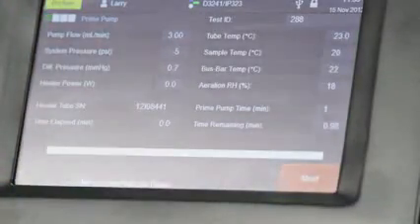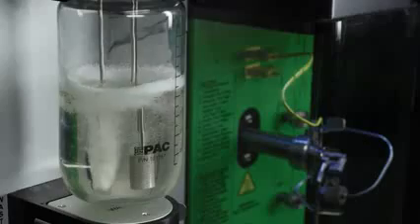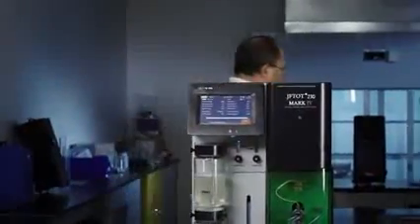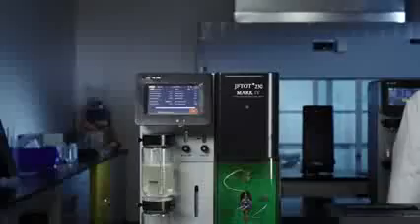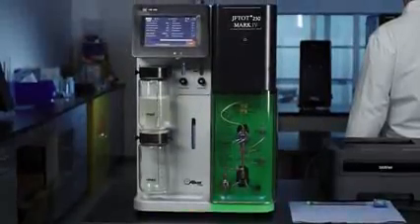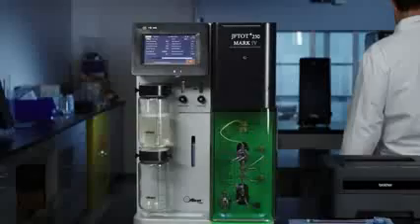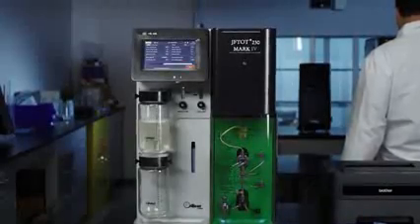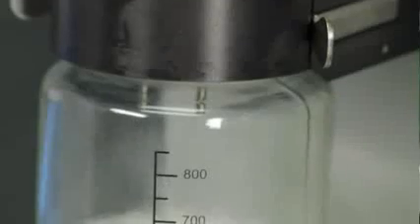The JFTOT 4 will prime the fuel pump automatically and then start the aeration process. One of the features that's different in the new JFTOT is that you no longer need to be in front of the unit. It will run automatically to the end of the test. Once the test is complete, the fuel in the lines of the test section will automatically be flushed out to keep the jet fuel from leaking out of the lines when you take the instrument apart.